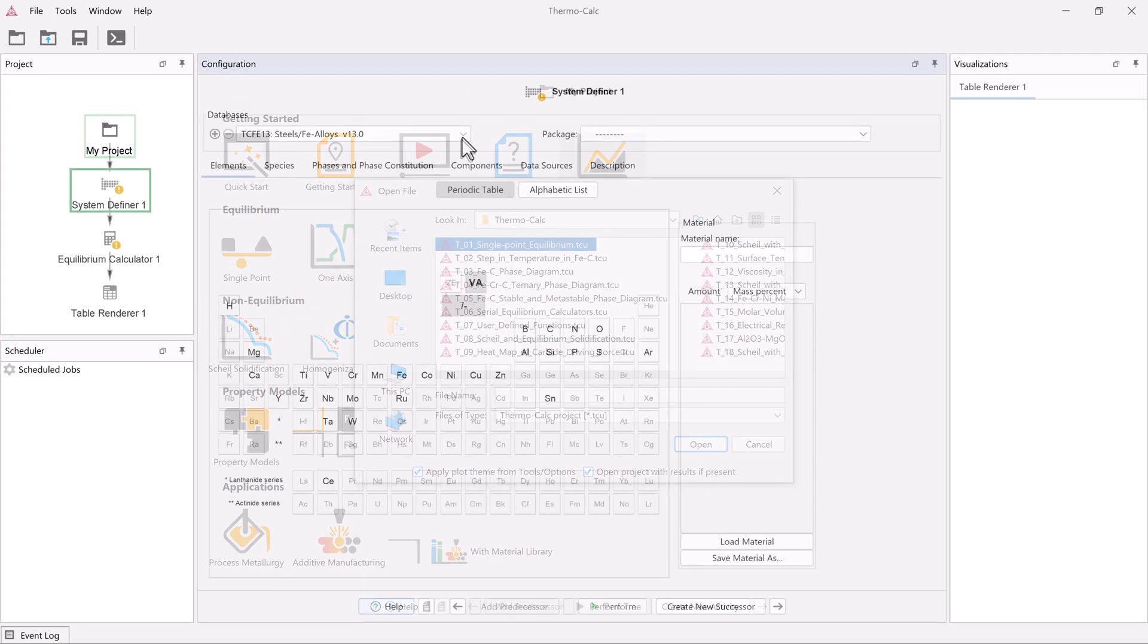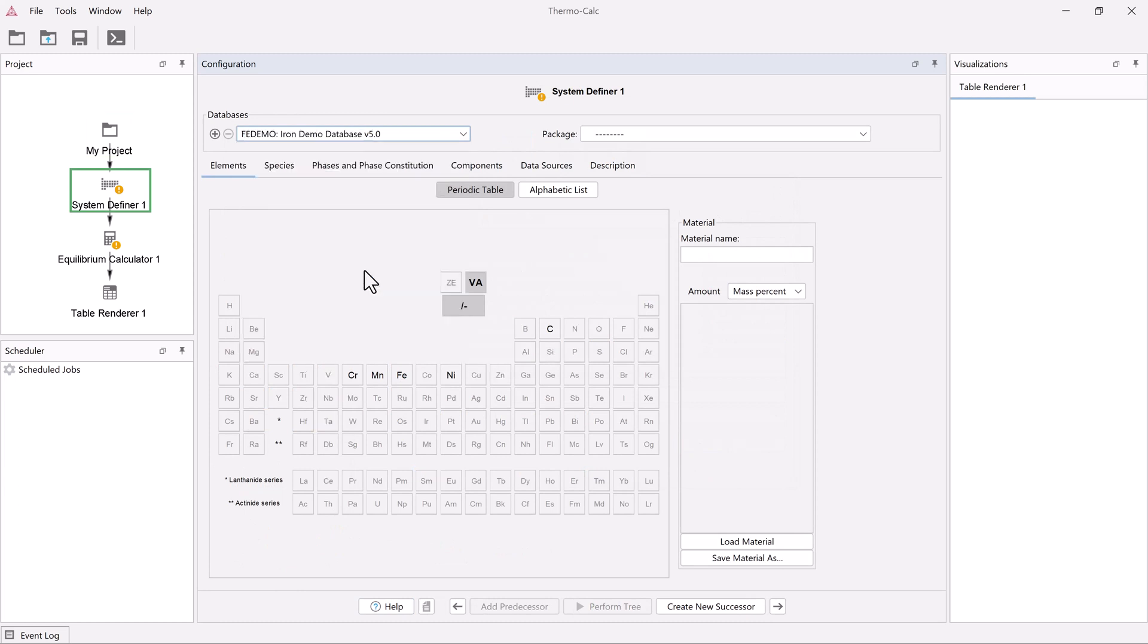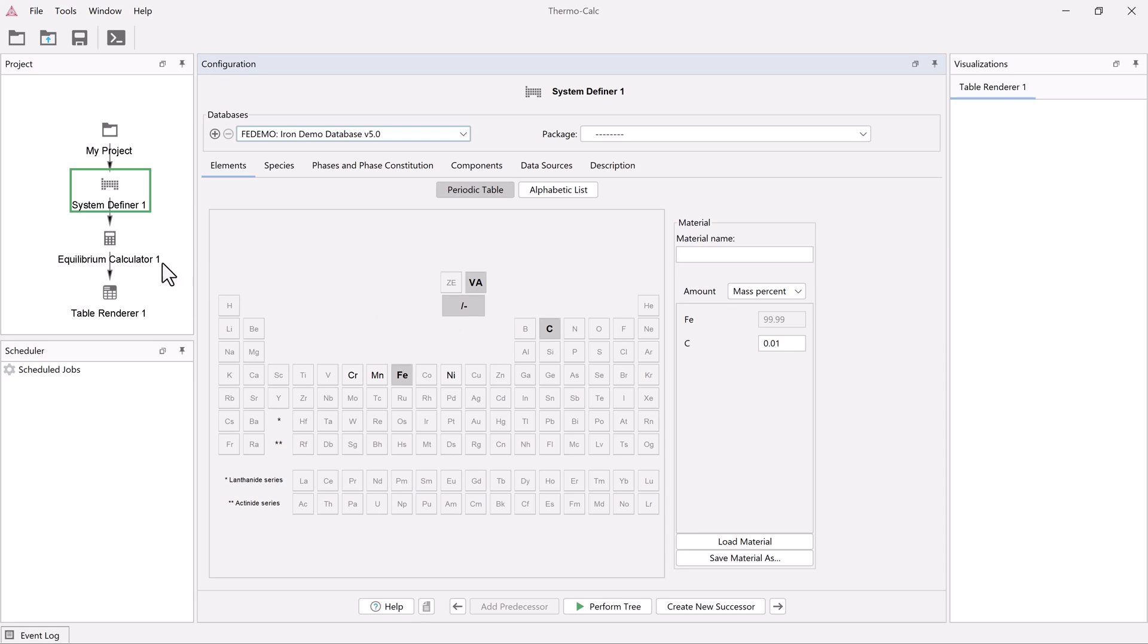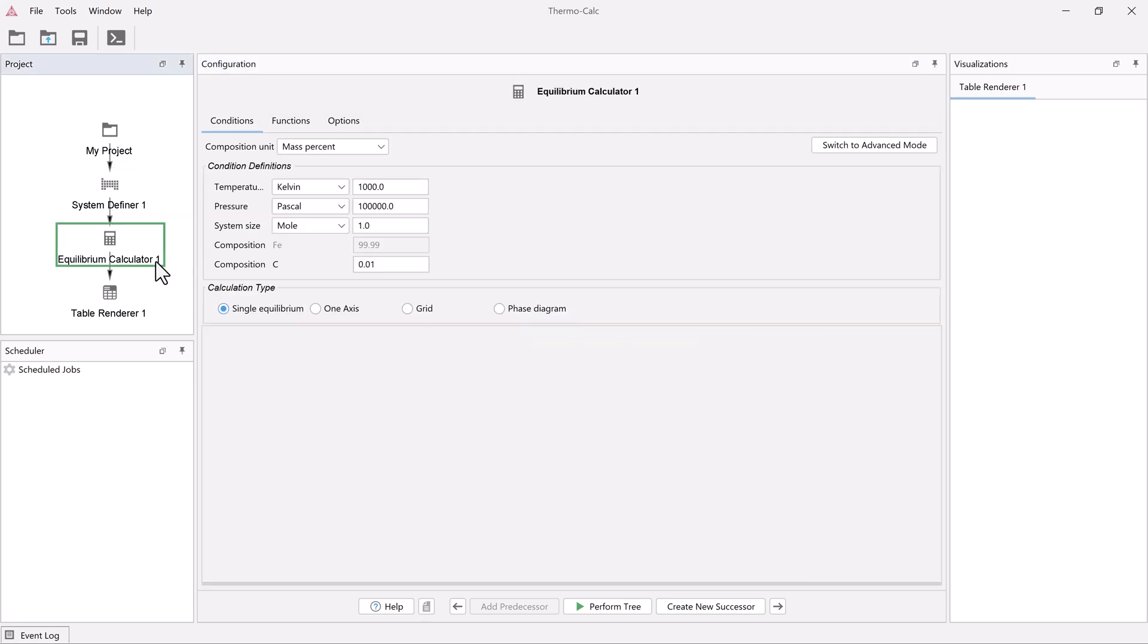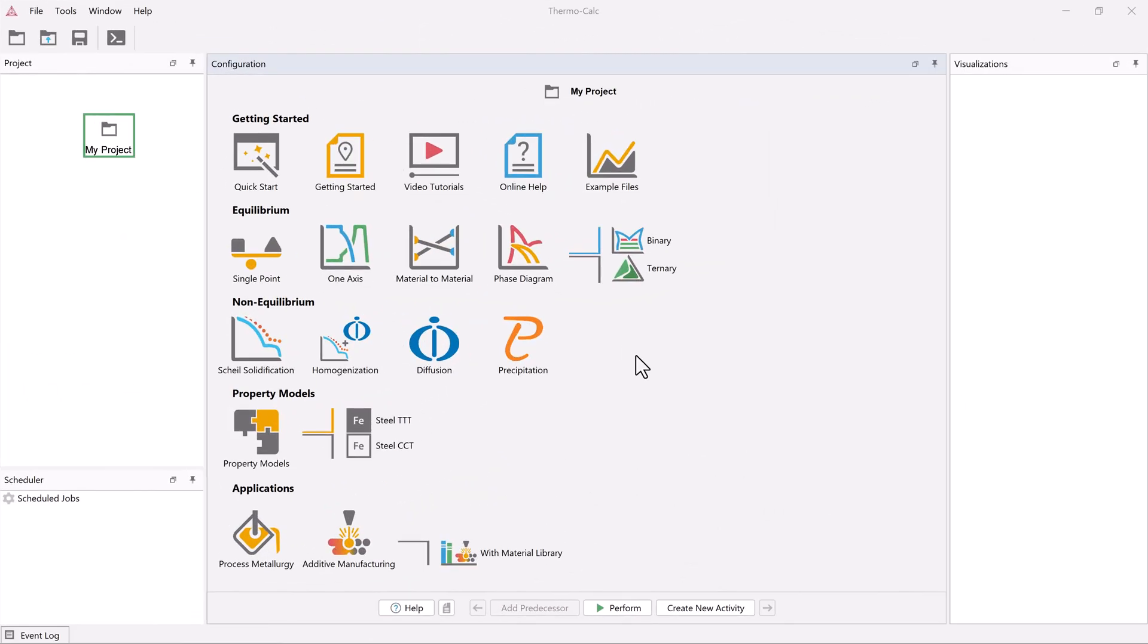In this video, I will walk you step-by-step through setting up the calculation, but you can also customize it with your own settings. To begin, open Thermo-Calc in the graphical mode.